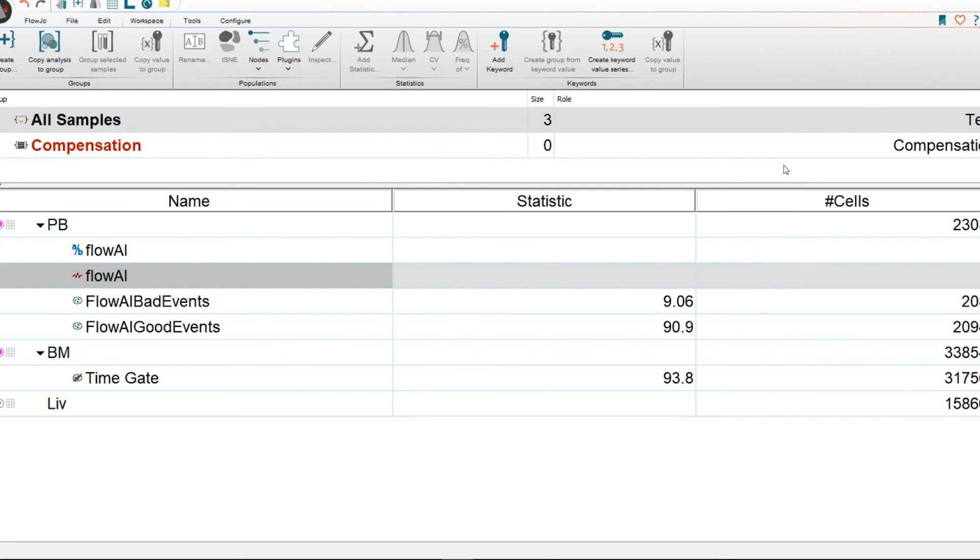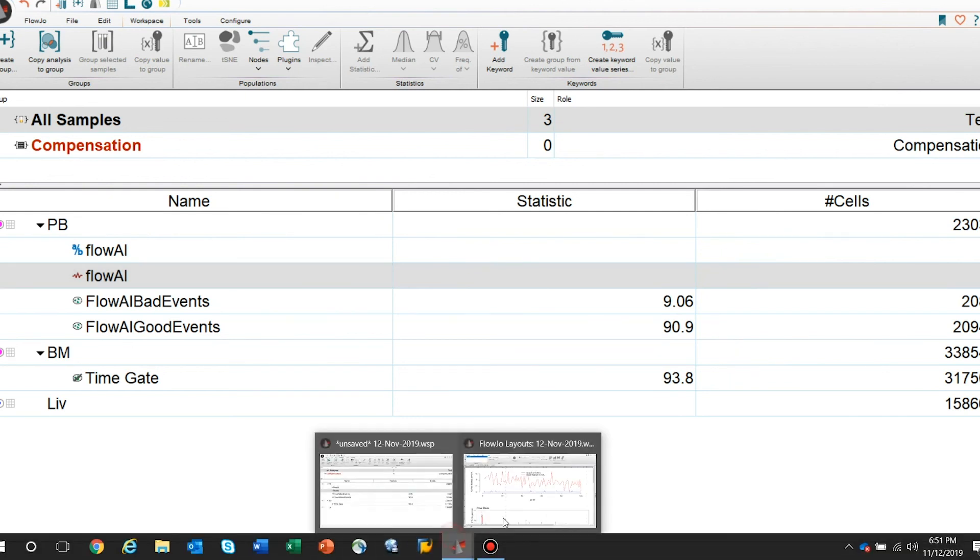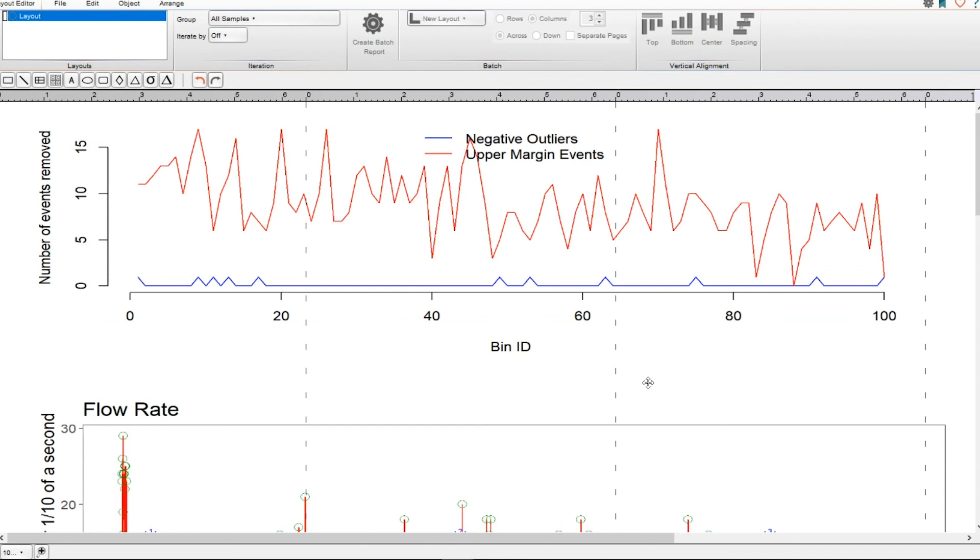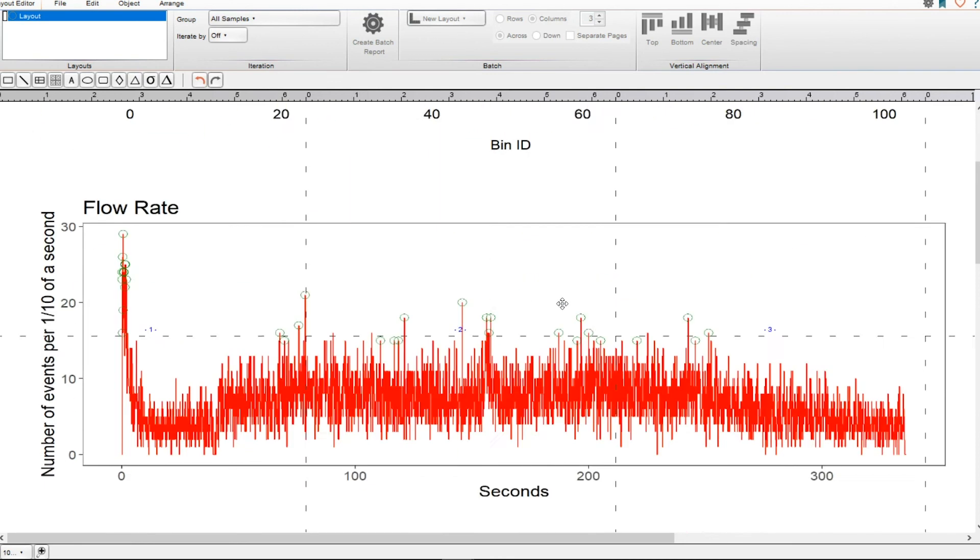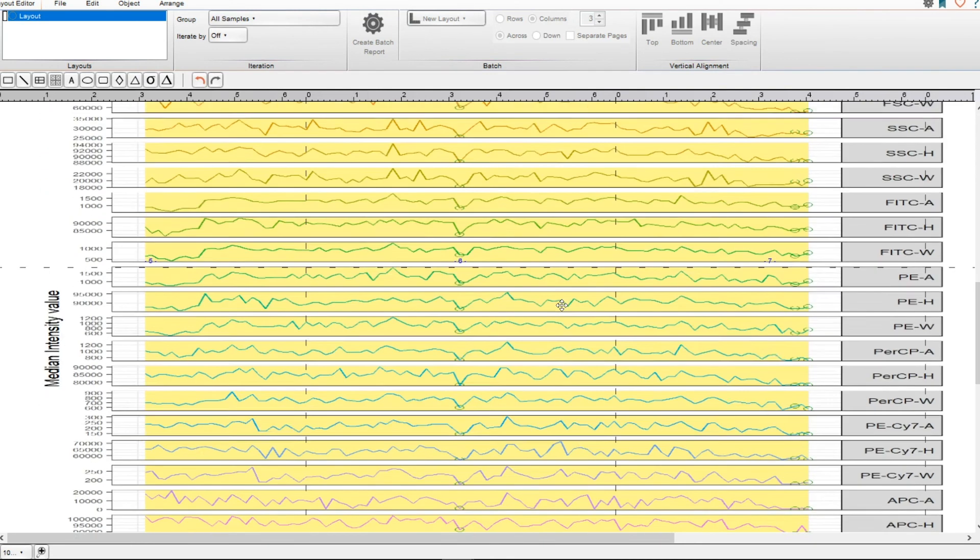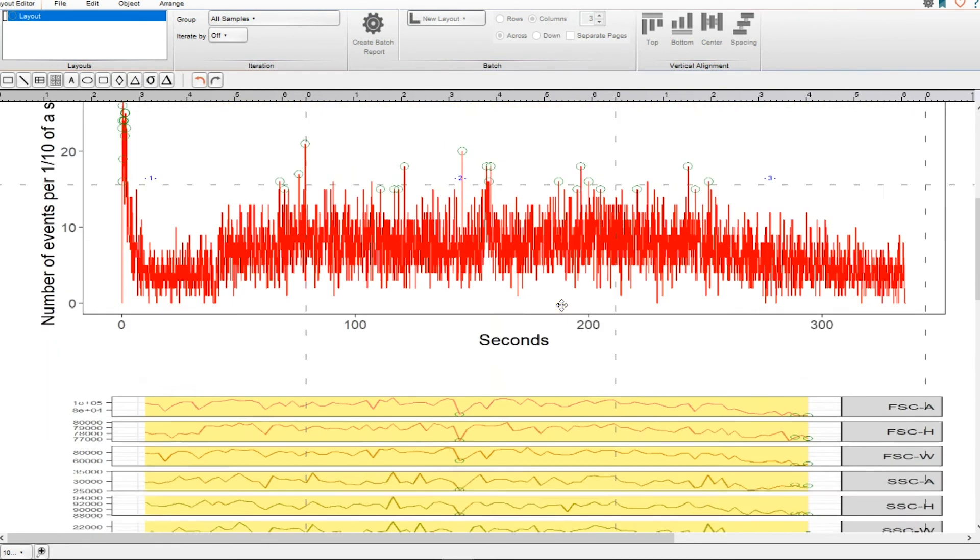What about if you wanted to go ahead and check why were these flagged? So you would click highlight and select the FlowAI node, and then you would drag and drop it onto your layout editor. So what you then would do is this will give you these visualizations as to how the number of events that will remove the bins and the flow rate and all the other information that I previously described.